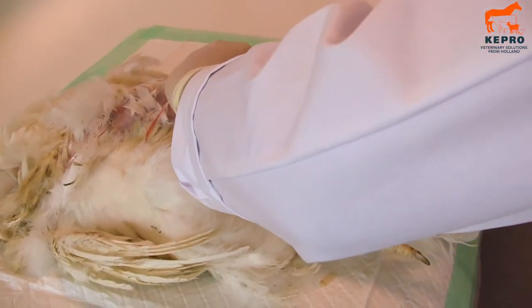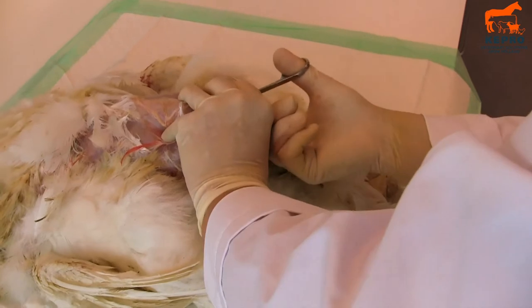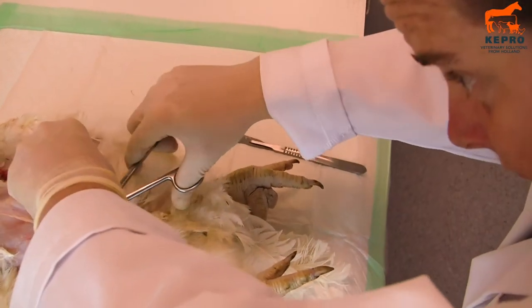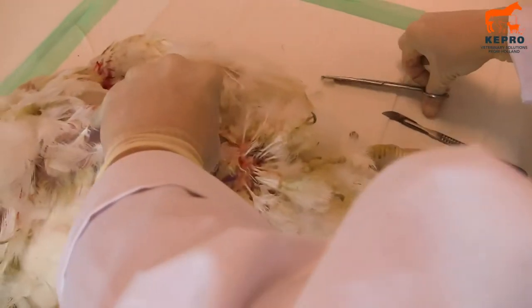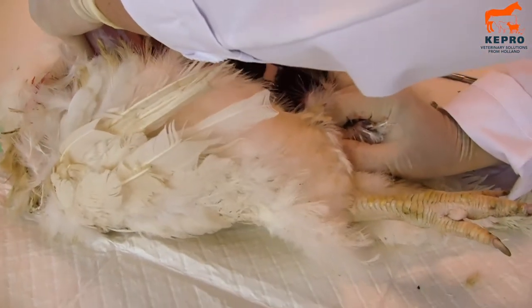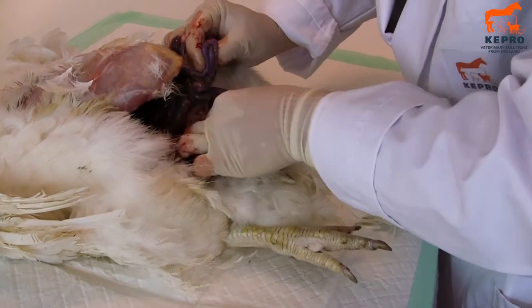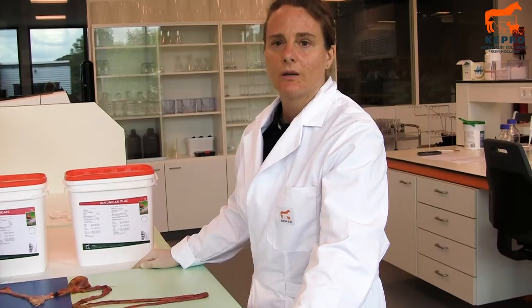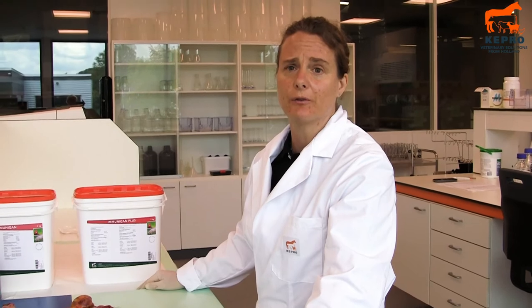Then we go up to the belly and what we need to do is pull the whole intestinal system out. Gut health is very important in poultry. If chickens have a healthy gut they usually also have a healthy immune system, and the gut is usually the place where a lot of diseases can enter.